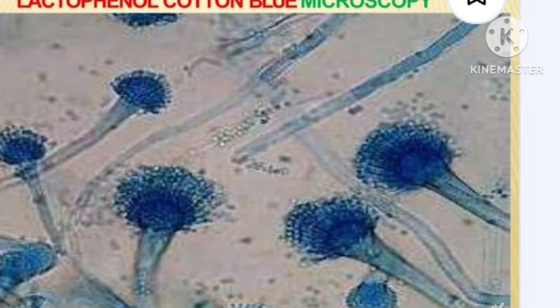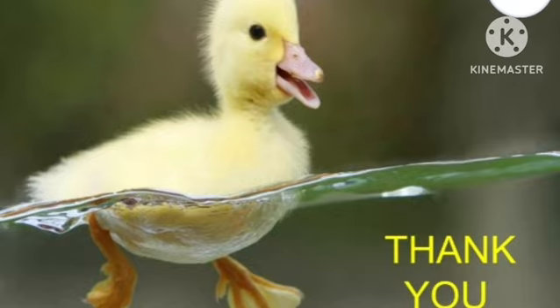Aspergillus is a common genus of mold. You can identify it by its distinct morphology: conidiophores, vesicles and conidia.